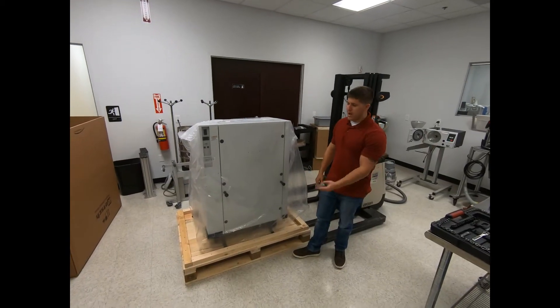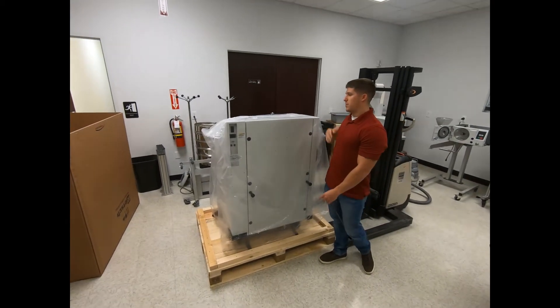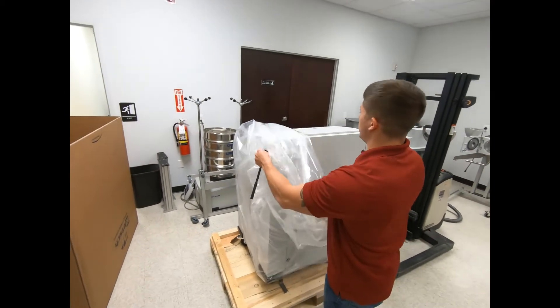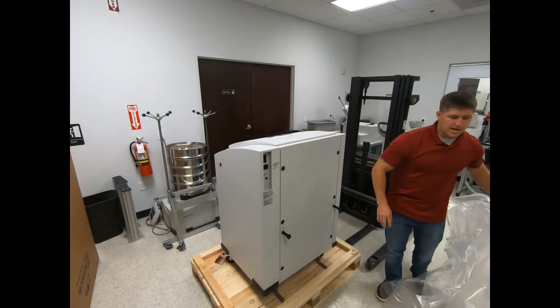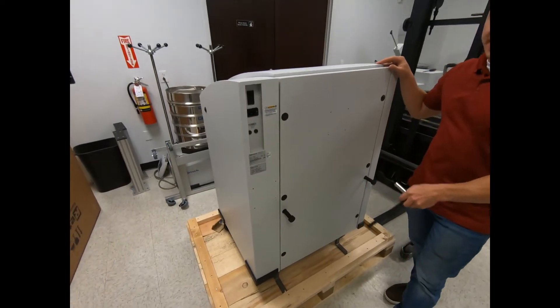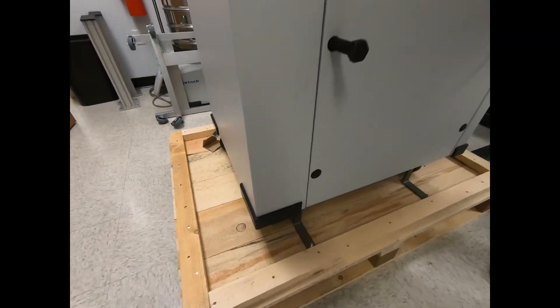Once you've removed both boxes off of the pallet, you're going to want to take off the plastic covering. Once the plastic is off, the next step is to remove the actual bracket that's bolting the unit to the pallet itself.